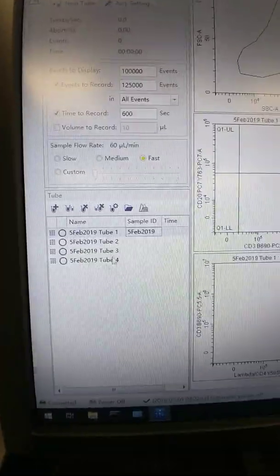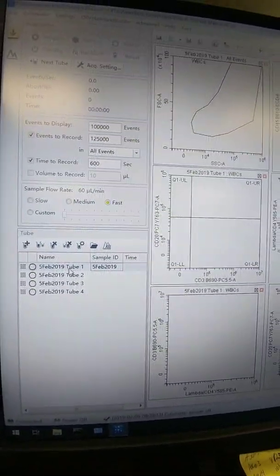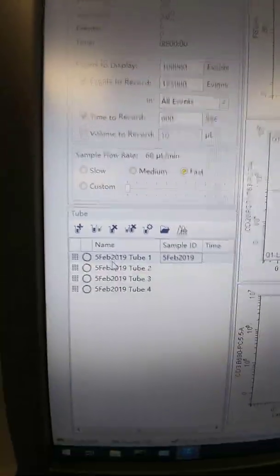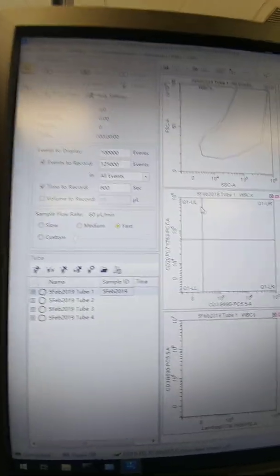I don't have any set up right now to show you. But after you record your data, it will automatically save the data with this in the name. And then when you load it, it will have this at the top of your histograms when you analyze.